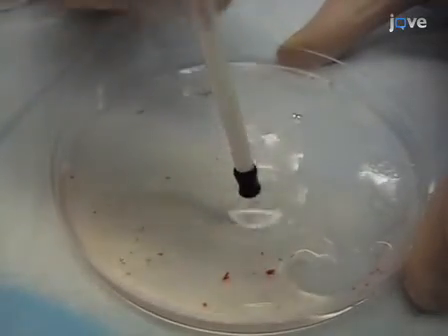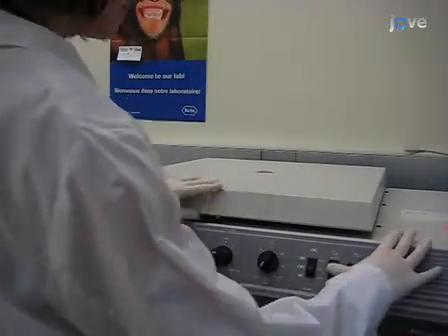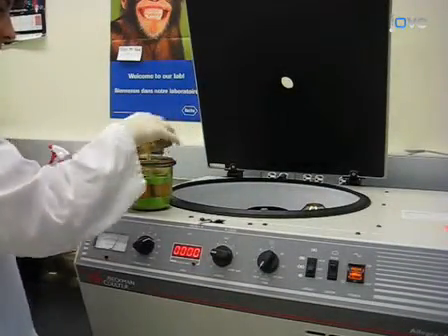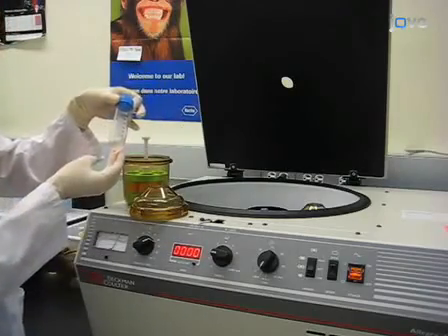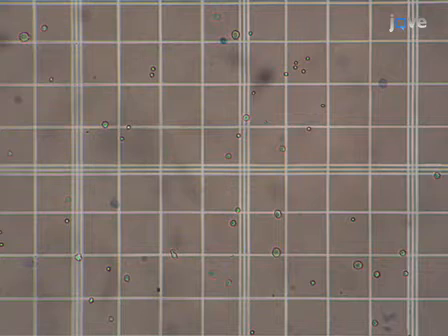Collect the bone marrow into a conical centrifuge tube, rinse the dish with PBS and add this to the tube. Pellet the cells by centrifugation for five minutes at 1500 rpm. Some researchers include a step to lyse red blood cells, however we have found that this step is unnecessary. Resuspend the pellet in DC media and count on a hemocytometer. This preparation is a mixture of bone marrow cells and a fraction are capable of differentiating into dendritic cells. The provision of GMCSF will favor the development of DCs but not other cell types, therefore it is unnecessary to deplete the other cells.